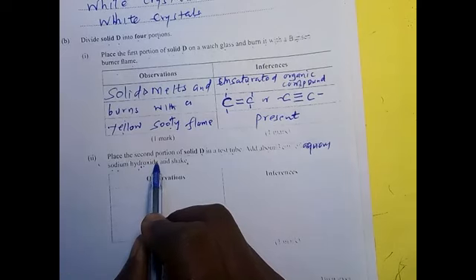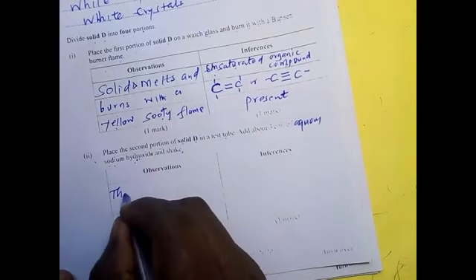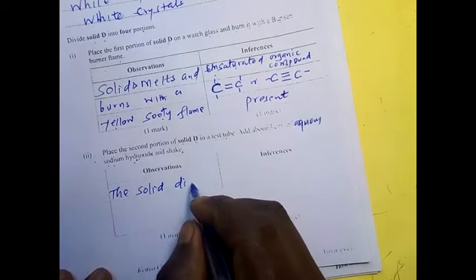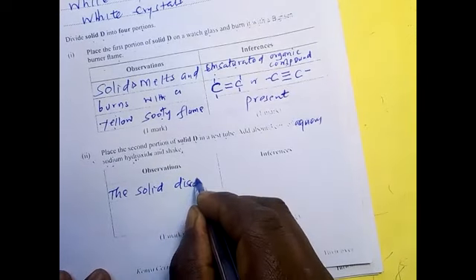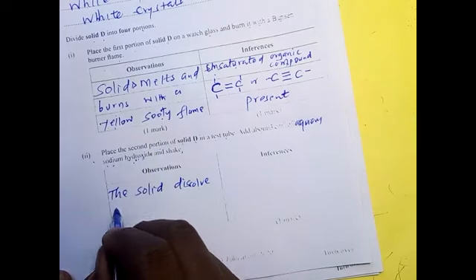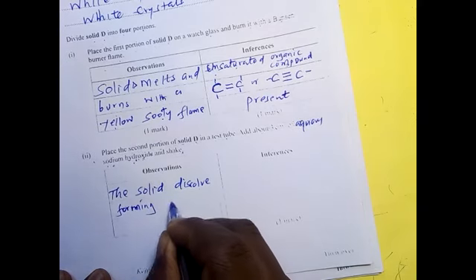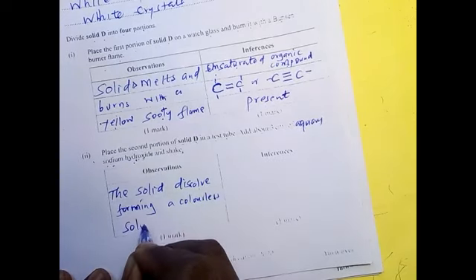So let me give you the observation. The solid D dissolves in sodium hydroxide, forming a colorless solution.